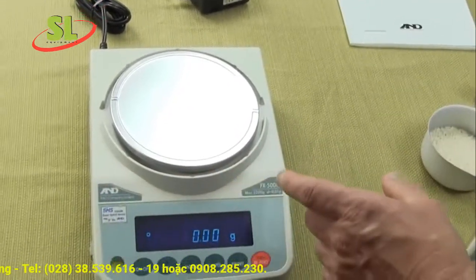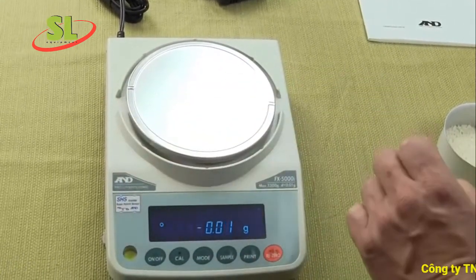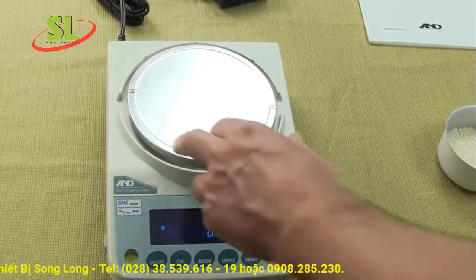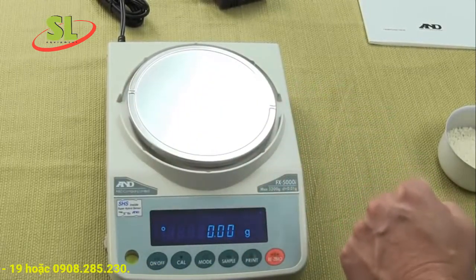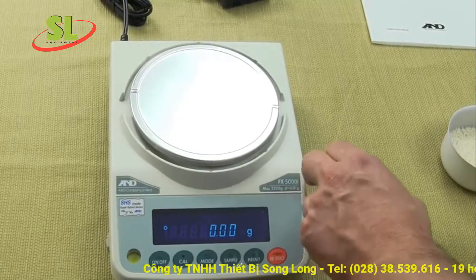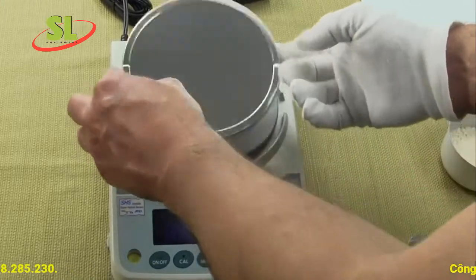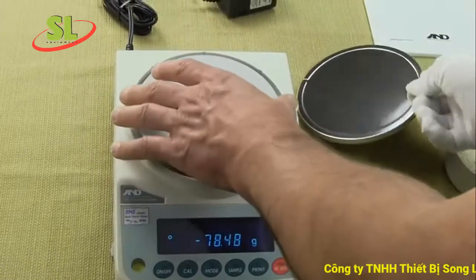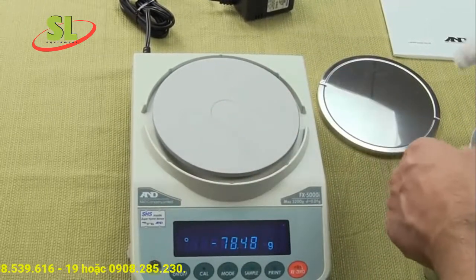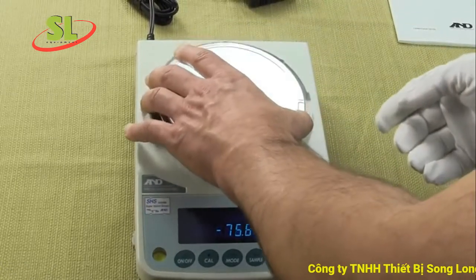The milligram balances come with a short draft shield. The 0.01 gram balances have a larger weigh pan — on this balance the pan diameter is 5.9 inches, versus 5.7 inches on the 1 milligram readability balances. You have a removable stainless steel platform, and underneath is a pan support. On this 5000 series, it's a cast aluminum pan support because of the higher capacity. Other models use a plastic pan support.